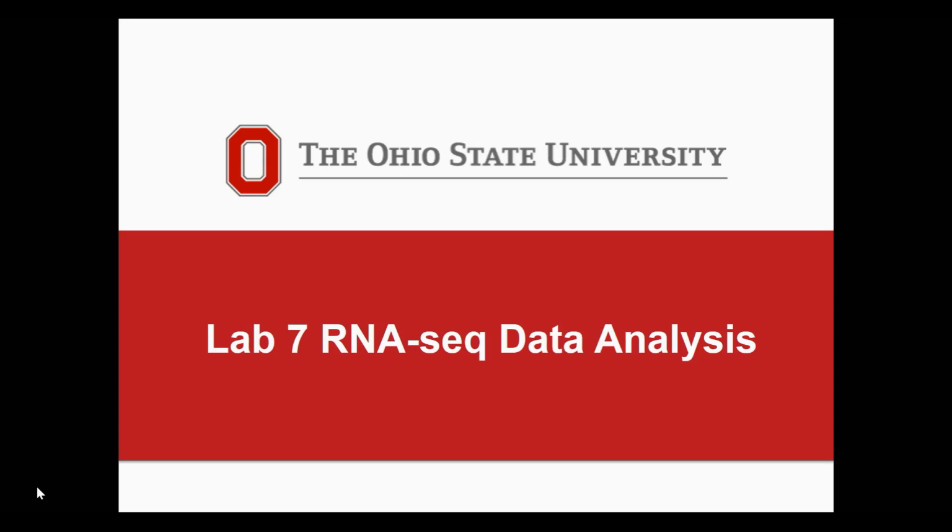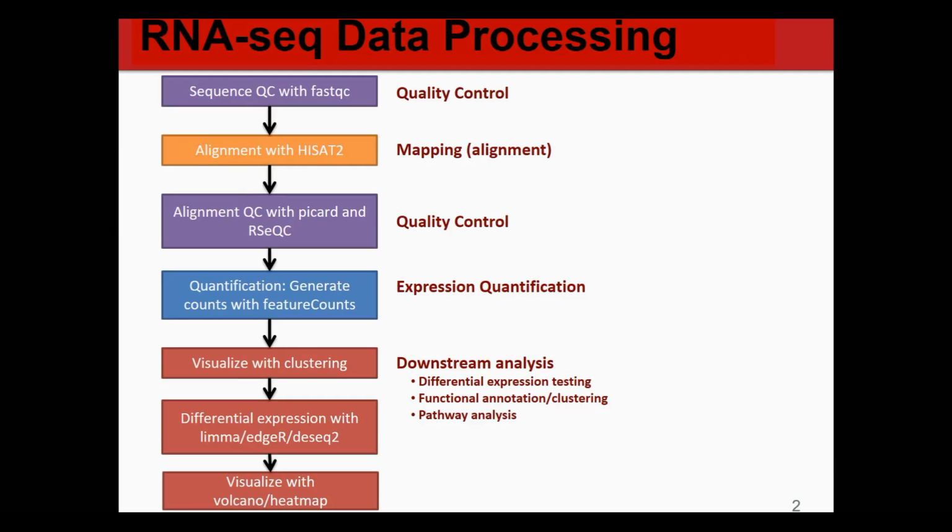Hello everyone. Today I will talk about Lab 7 RNA-seq data analysis. Here is the typical RNA-seq data processing workflow.